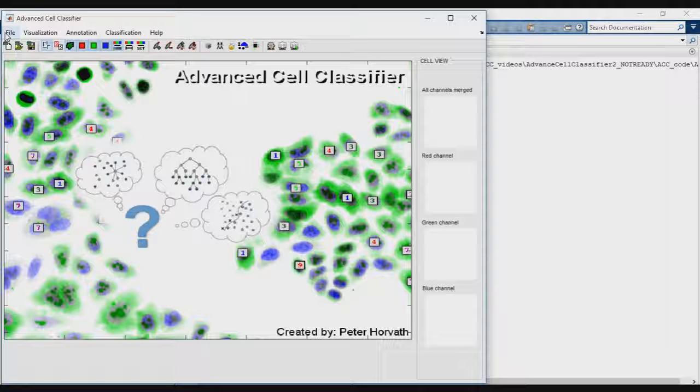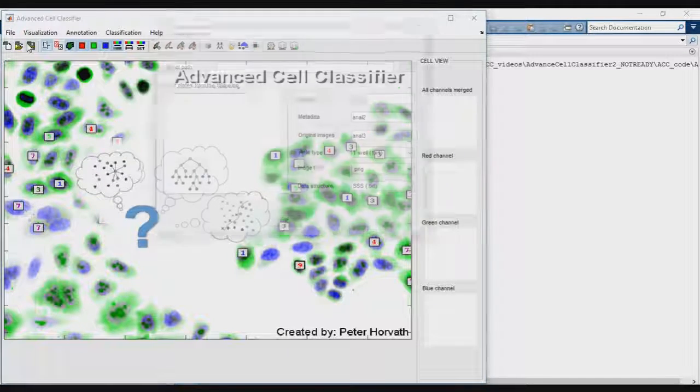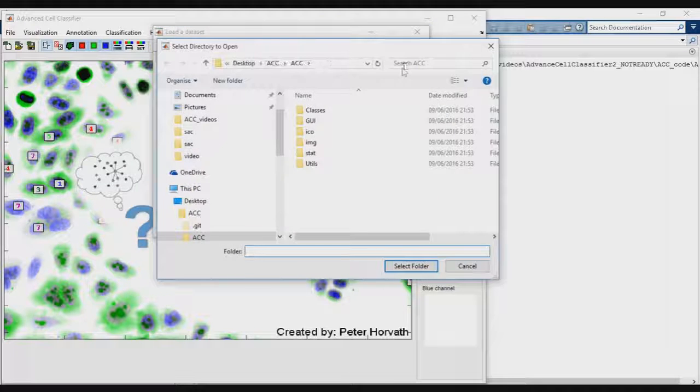Let us start analyzing a sample dataset. Click on File - New Project to load the datasets.